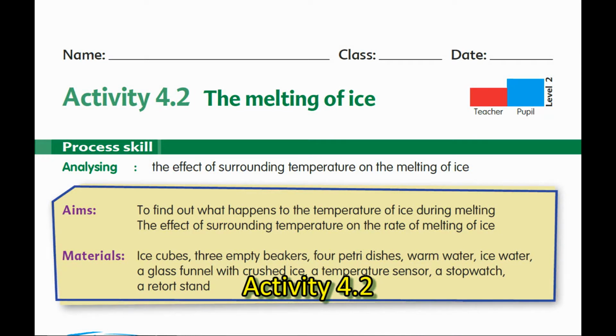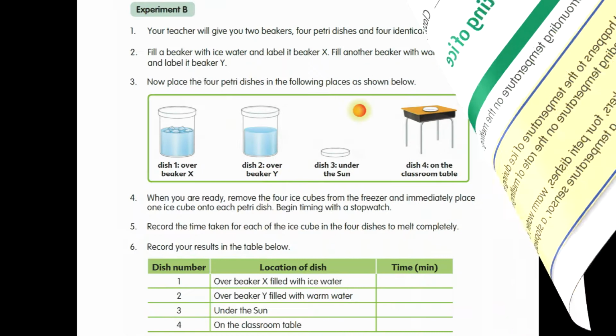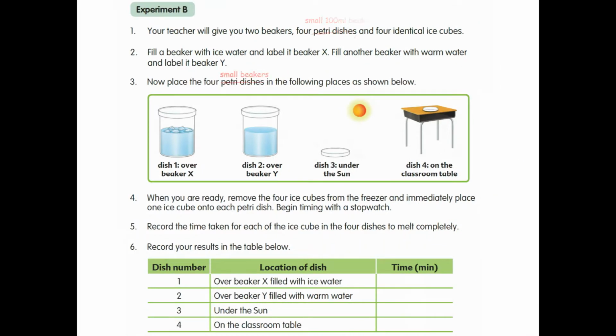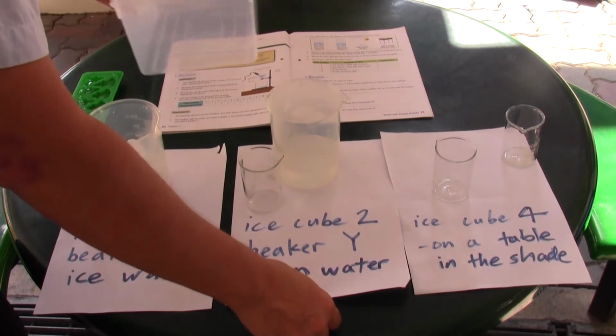Activity 4.2 on the melting of ice, Experiment B: the effect of surrounding temperature on the rate of melting of ice. I'm going to be using small beakers instead of petri dishes. Here we have an experiment set up for experiment B.